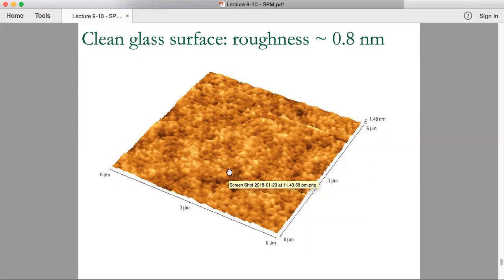exerting on the cantilever tip, and that is measured, and a feedback signal will be generated to either increase the height or increase the current. While doing that, the change is recorded somewhere, and that is converted to get the image. So there are no colors actually. These colors are artificially induced to make it easier for the observer to get an idea about it.